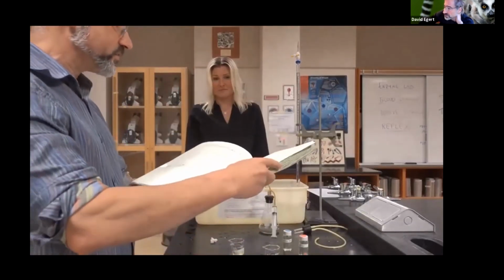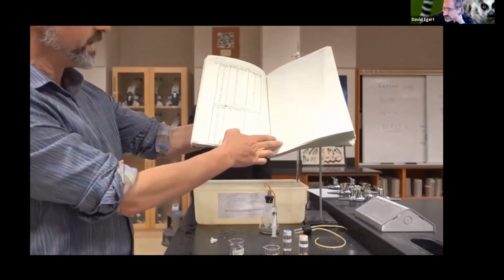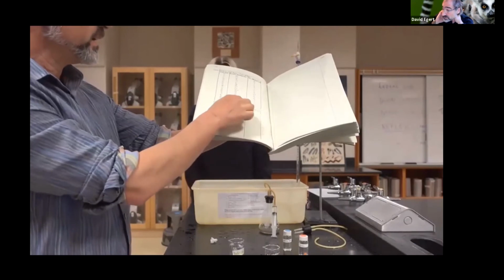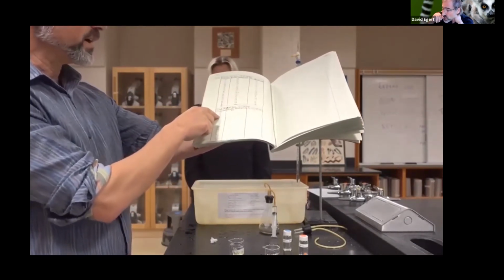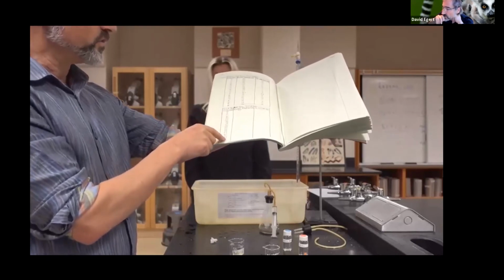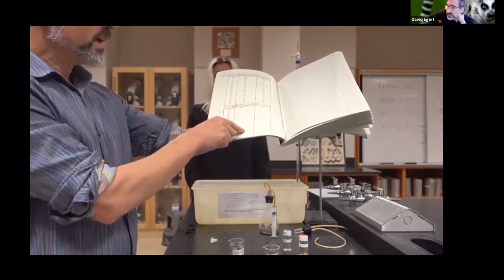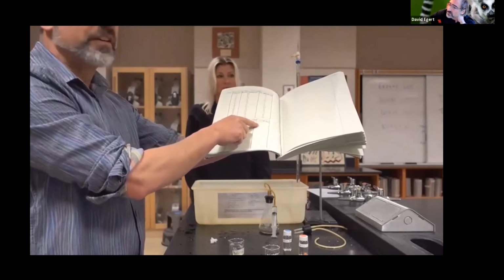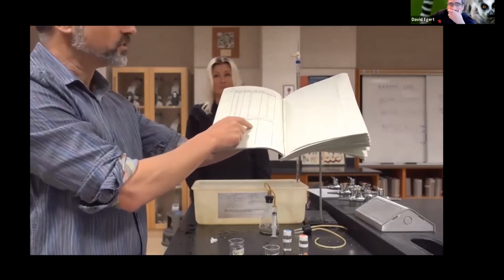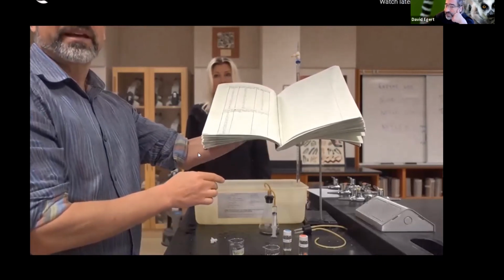It makes sense to usually set up some kind of a chart ahead of time. This is already, trial 1's already been here. But here I know the time is going to be in intervals of 5 seconds. I've got a space here for my burette reading. And then what I'm really interested in is the oxygen, which is going to be 50 minus whatever the burette reading is. So I have that set up, so it's going to be nice and easy and clear, right? Because the burette is going to start at 50 mils of water.